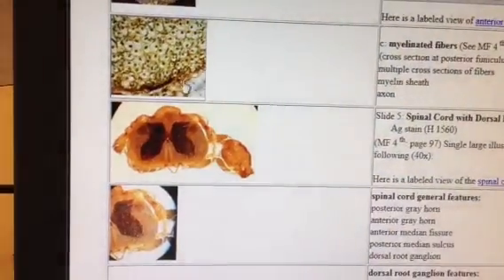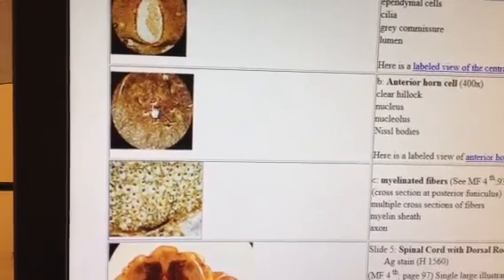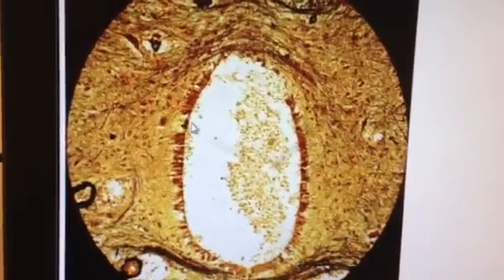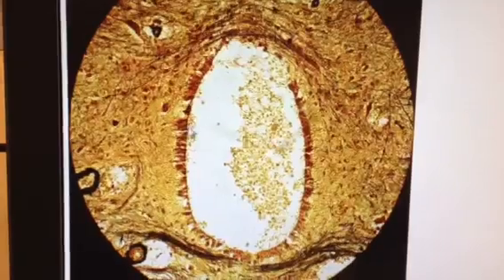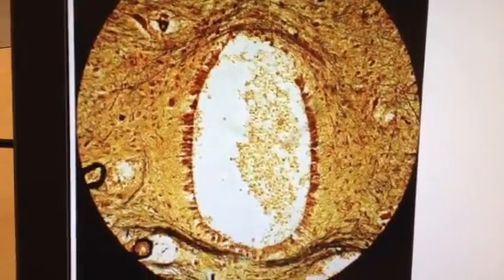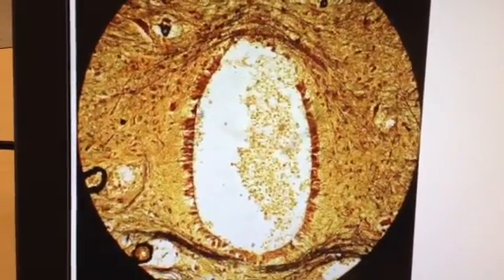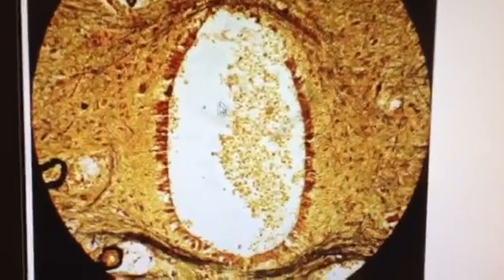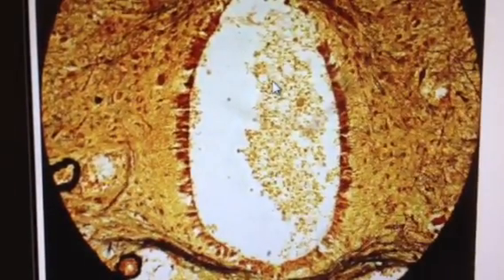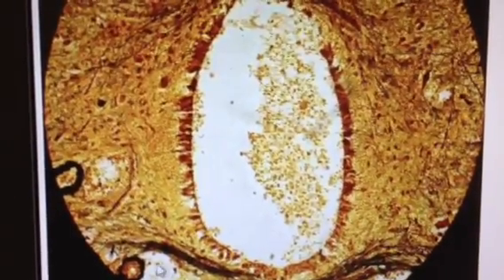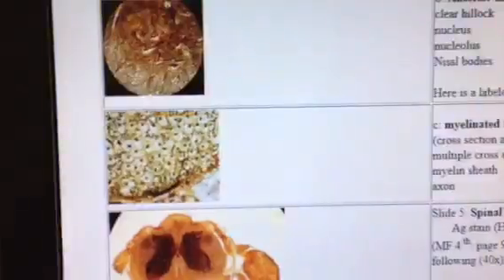Moving into the central canal and looking at supportive neuroglial cells, this chain of cells surrounding the central canal consists of ependymal cells with CSF being circulated by cilia at their apical surface. This is an example of a blood vessel, lined with endothelium.